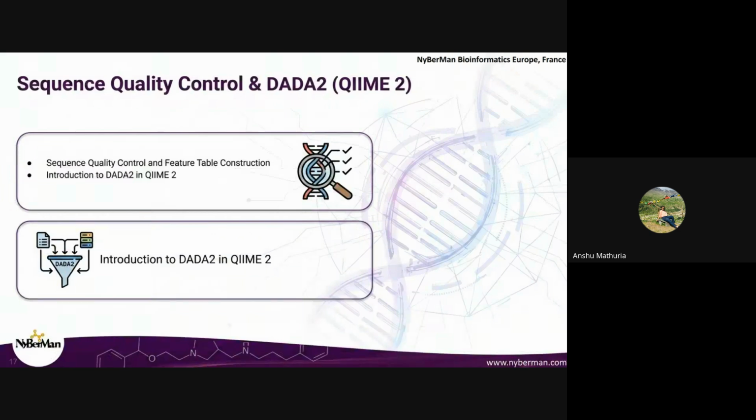As I mentioned before, when we proceed further with the sequences, there might be certain errors, unwanted sequences or short reads present, and some sequences could have a low quality score as well. The way we saw in the last session when we checked that bar plot, I told you that the bases after 100 show a very low quality score. That means from there the base interpretation or prediction cannot be taken very seriously because the quality score is very low. The system itself is not sure whether that base is present there or not. So to avoid any misinterpretation, we generally remove those parts of the sequences.